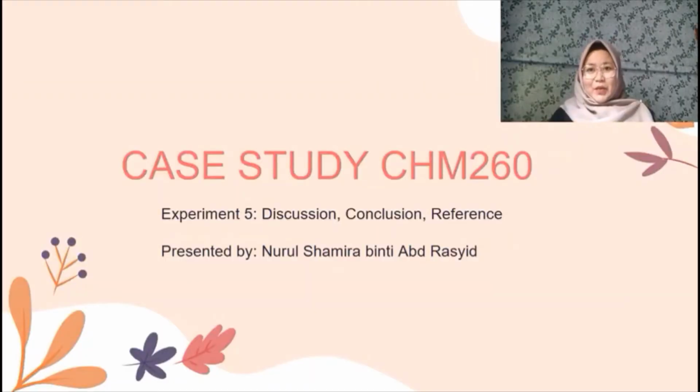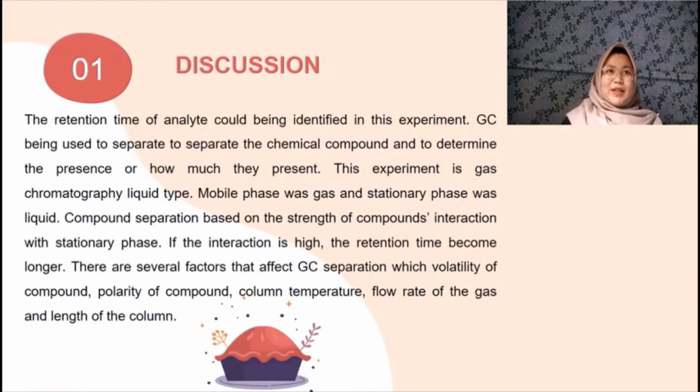Okay, Assalamualaikum. My name is Nur Shamira. I will proceed with the discussion, conclusion and references for experiment 5. Okay, let's move to the discussion.